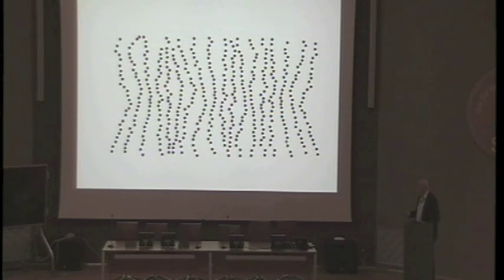Now let's assume this is the object. So what is the object? It could be, if you will, microtubules or something consisting of molecules. In any case, it's molecules. That's because nature is made of molecules. And we do fluorescence microscopy. For the moment, we're going to restrict ourselves to fluorescence microscopy, although if you think about the concept from the physics viewpoint, it's not limited to fluorescence imaging. But let's assume it's fluorescence imaging. That's the most important type of microscopy for the life sciences anyway at present.